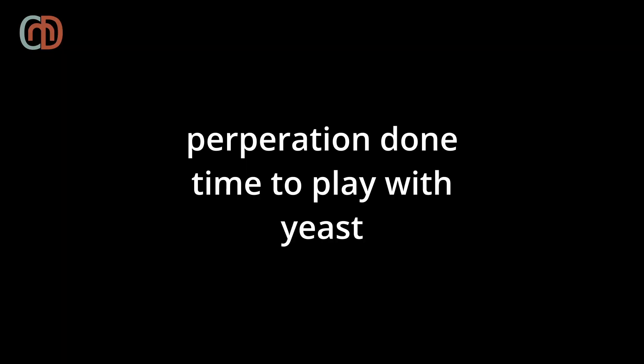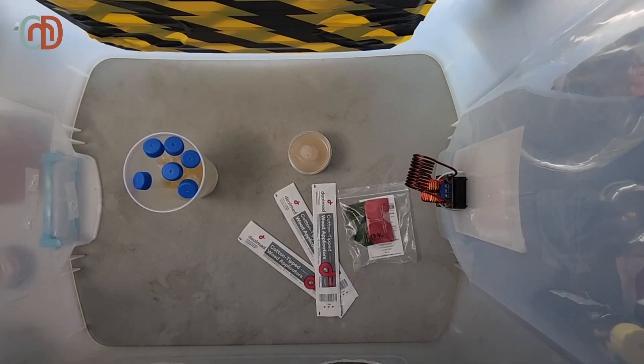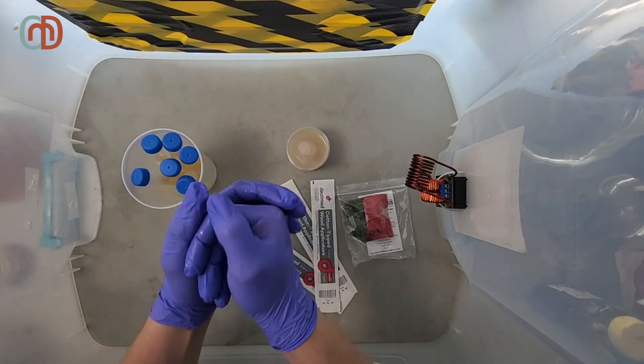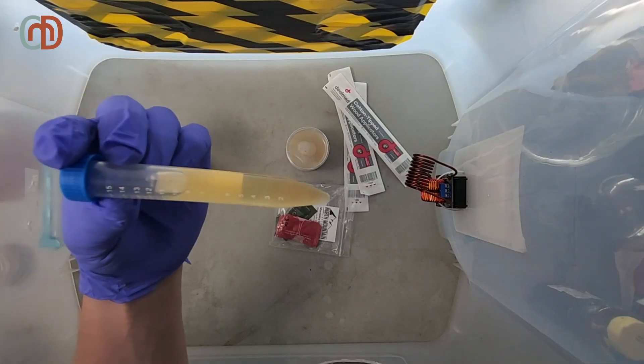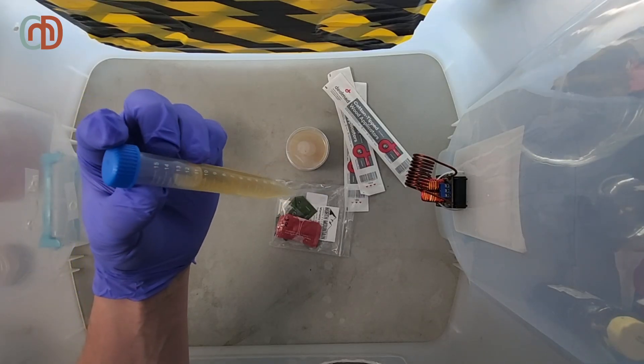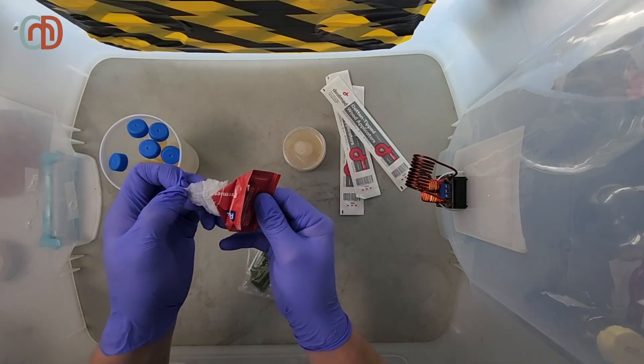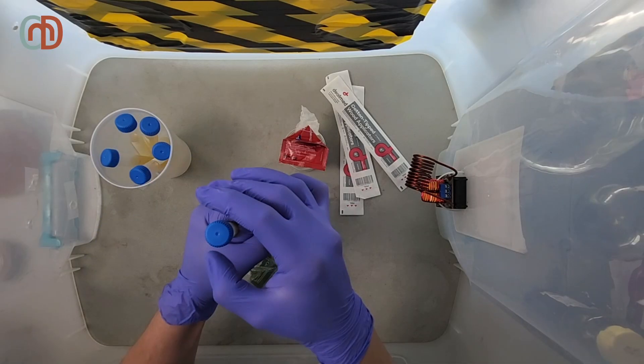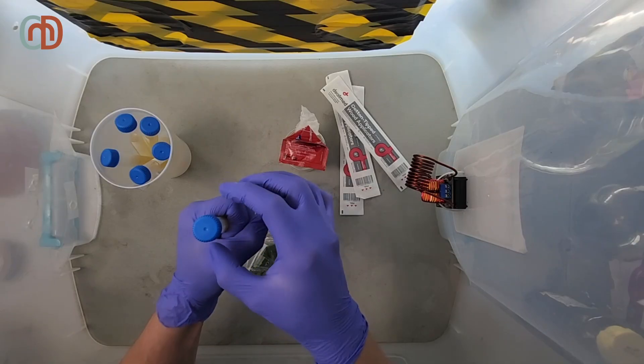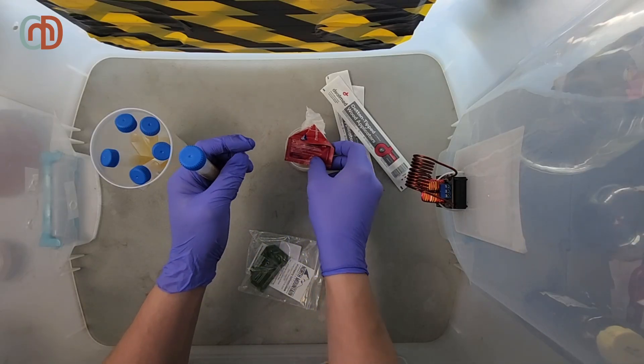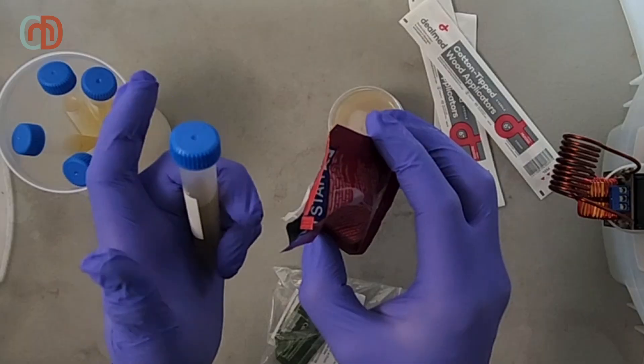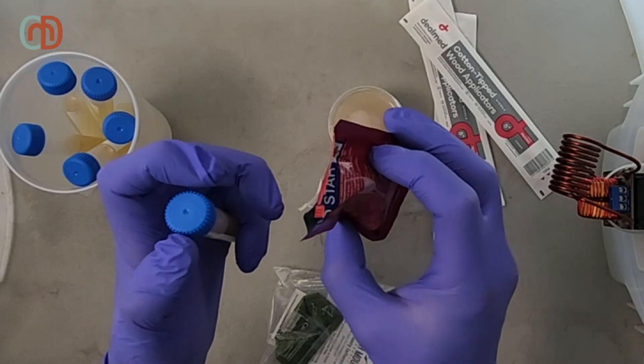Now it's time for a yeast party. I move everything to my still air box, and I get three packs of sterile swabs along with three petri dishes. You might notice some sediment in the honey from the pressure cooking process, but this isn't a problem. After gingerly opening the commercial yeast packet, I unscrew the lid and leave it loose. That way I can open the container with one hand, while dumping the yeast in with the other.